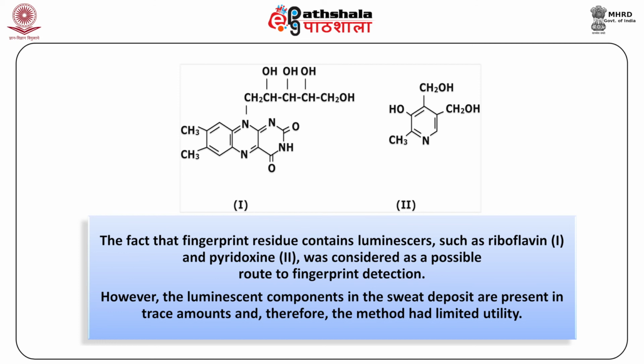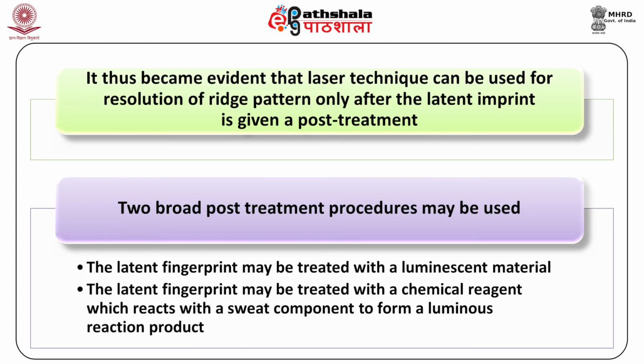However, the luminescent components in the sweat deposit are present in trace amounts and therefore the method had limited utility. It thus became evident that laser technique can be used for resolution of ridge pattern only after the latent imprint is given a post-treatment.